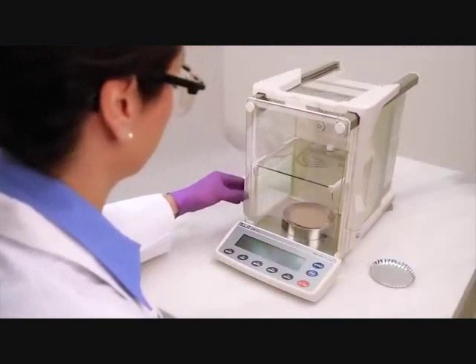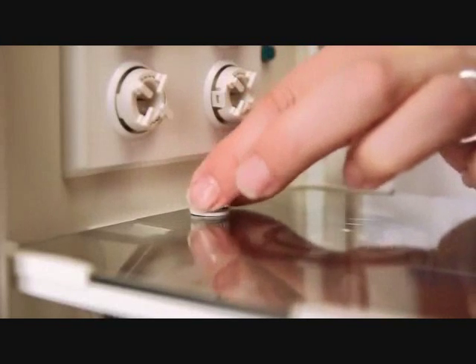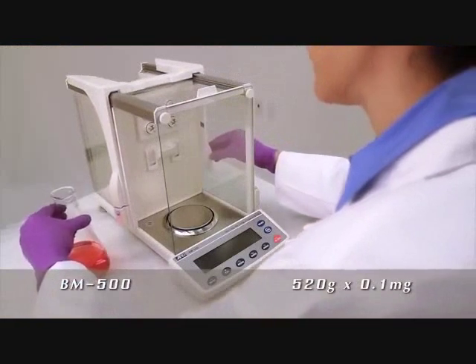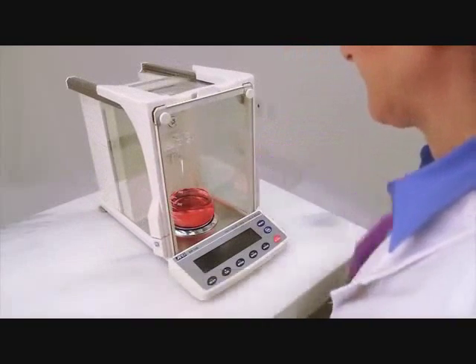Now, there's a real choice when it comes to six-place balances. For five-place and four-place measurements, you can easily weigh taller objects in all six models simply by removing the shelf, including the BM500 with its 520-gram capacity.